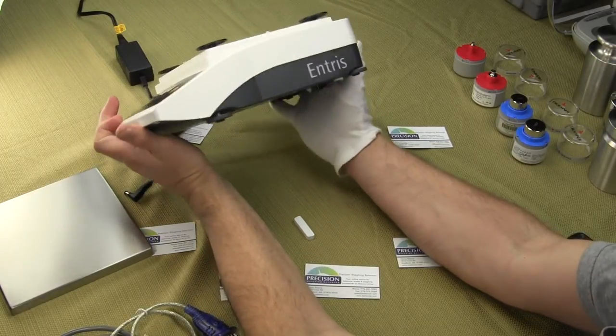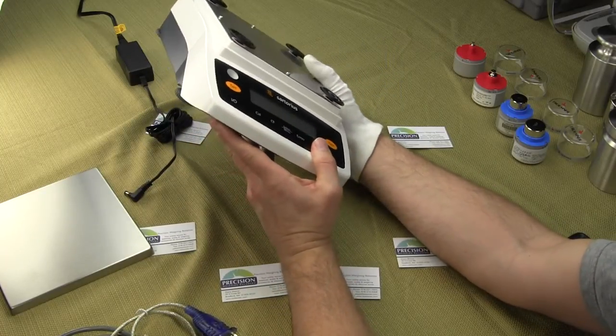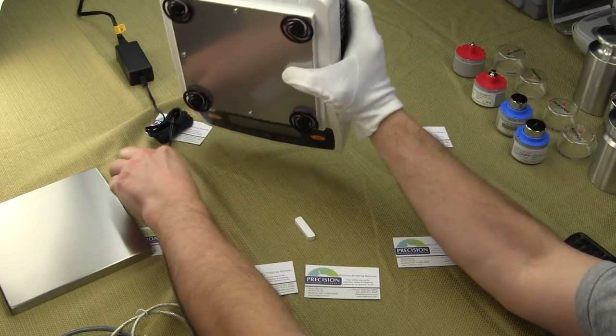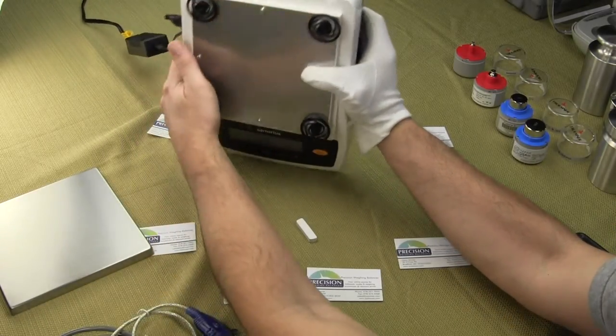This is a very nice basic balance — Sartorius' new entry series for the lab market. I'll just plug in the AC adapter. This only runs off an AC adapter.